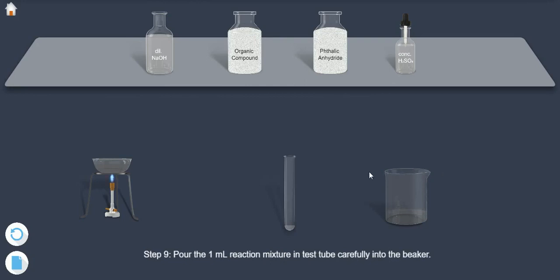Step 9: Pour the 1 ml reaction mixture in test tube carefully into the beaker.